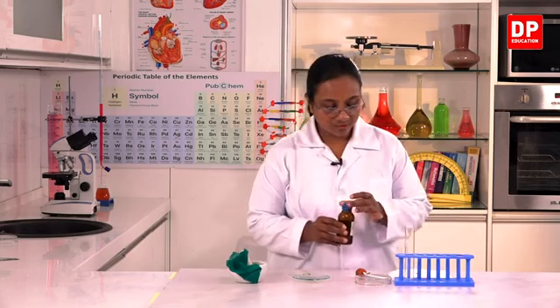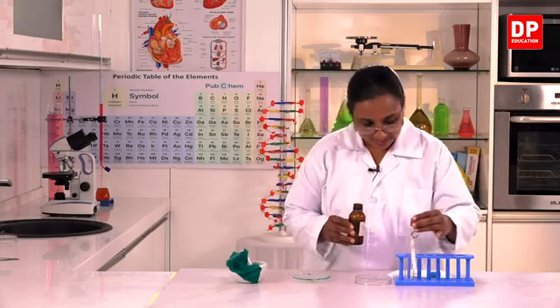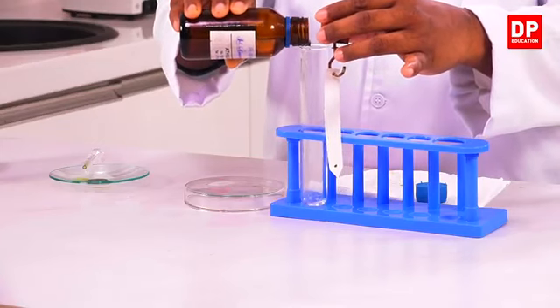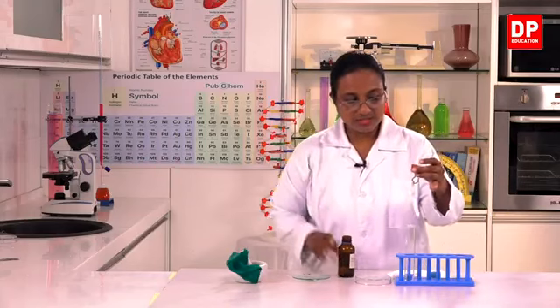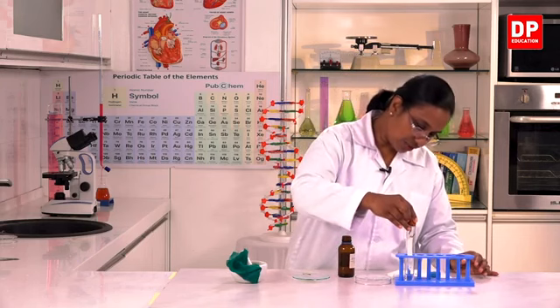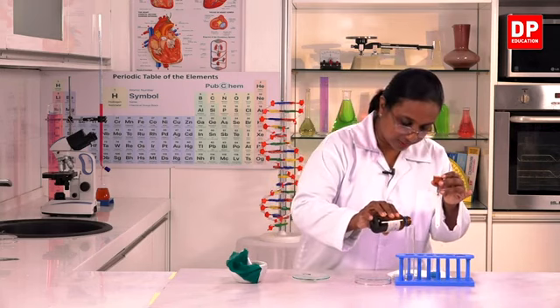So I will have to take the acetone into a boiling tube, but I have to make sure that there is enough acetone so that I can slightly dip this. The paper has to slightly touch the acetone. Too much is not good. At the same time, we should have enough acetone to be in contact with the paper.